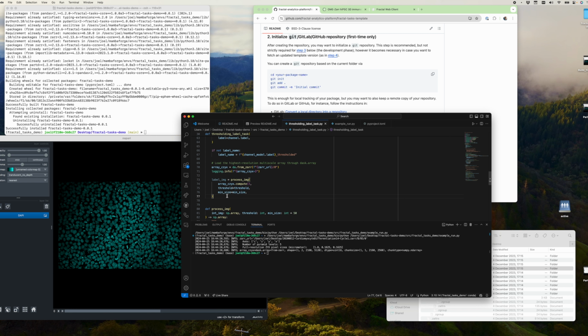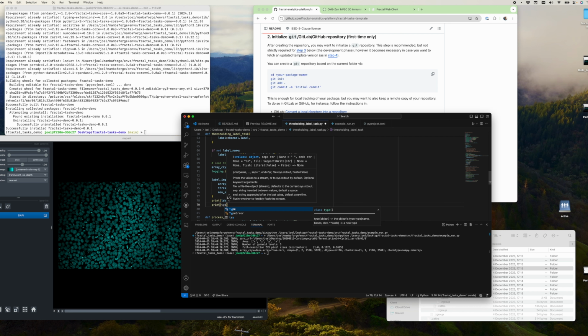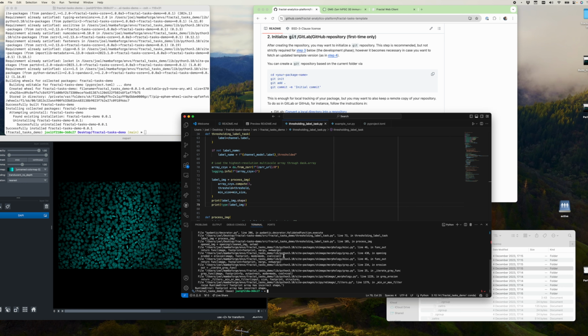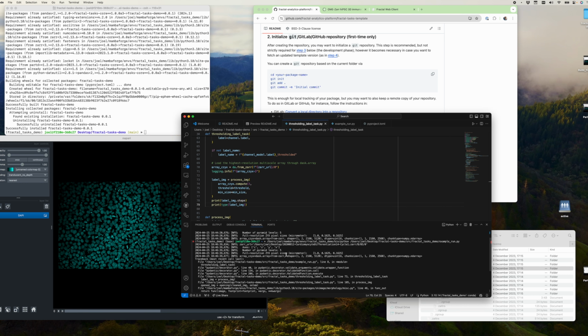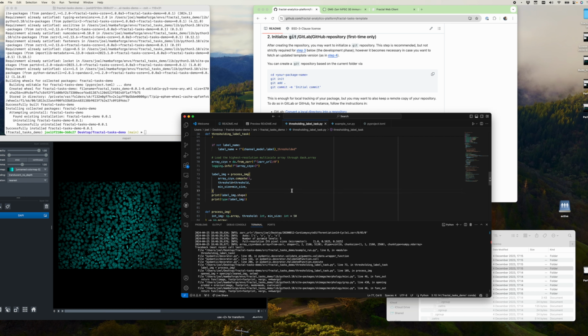So we could run this, and then maybe we want to print the shape of our image, maybe also its type. Something failed. And debug locally.